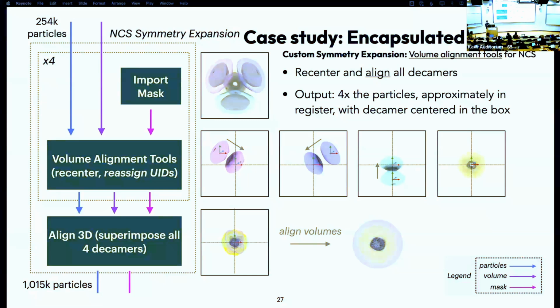So D5 followed by the tetrahedral seems to be making it more complex. For example, D5 in combination with the tetrahedral is making it more complicated. So D5 with any other operations, for example any other point groups like C2 or C3, would be easier to process. Are you saying that instead of this tetrahedron, there is some other, more symmetric arrangement, some other symmetry mismatch? How would you handle that?